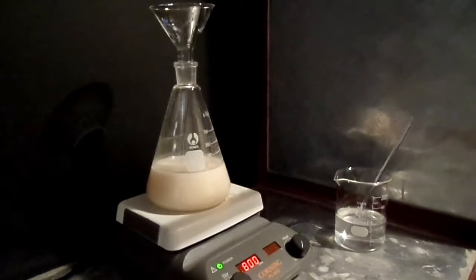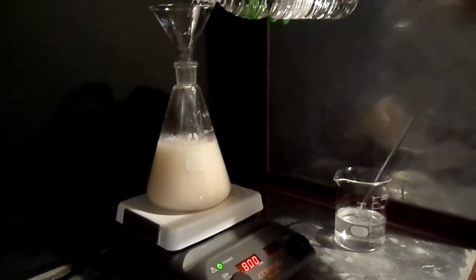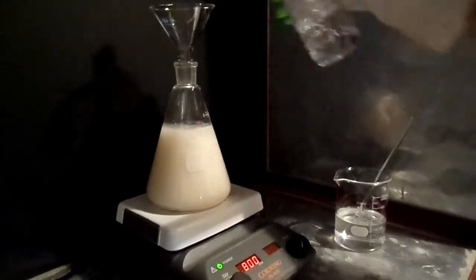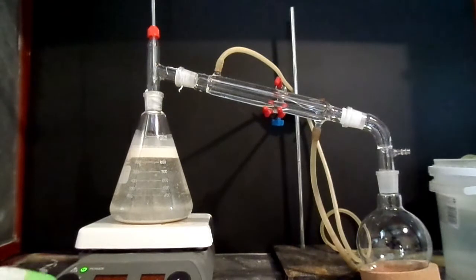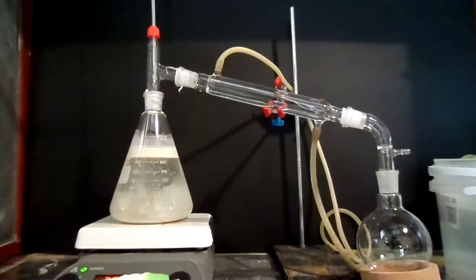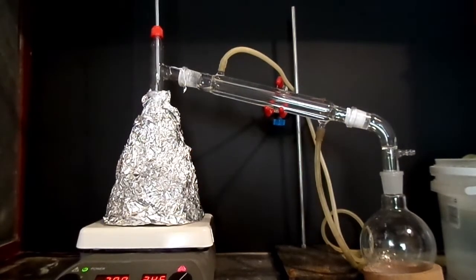The 1 litre flask was then topped up with water to approximately 900 milliliters, set up for distillation, and heated to boil. I also decided to insulate the flask with some aluminium foil.